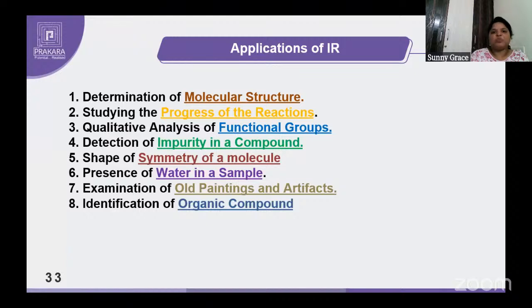So this is all about infrared spectroscopy. I hope we have covered almost all the topics related to IR spectroscopy: the introduction, principle, vibrations, instrumentation, the different types of instruments involved in IR, the reasons for molecular stretching, and then the applications of IR.